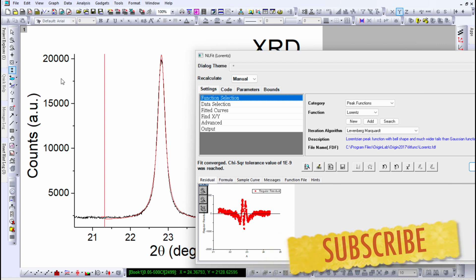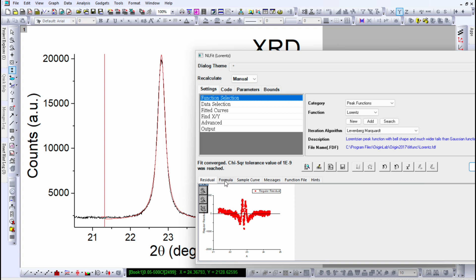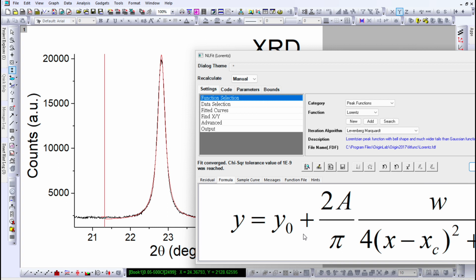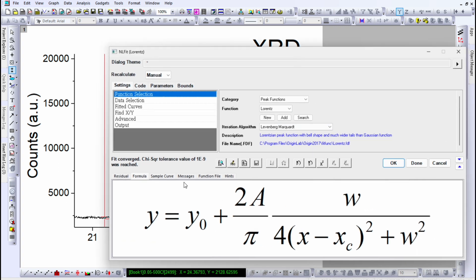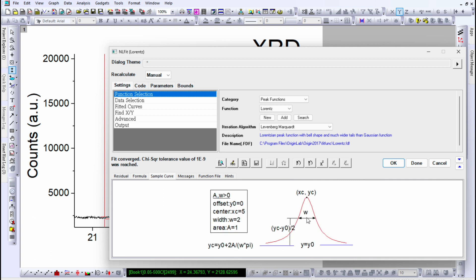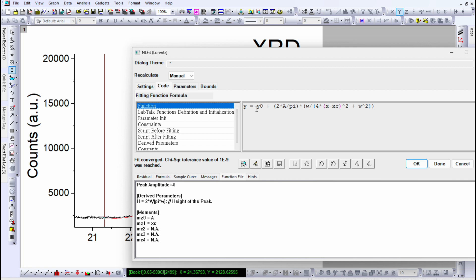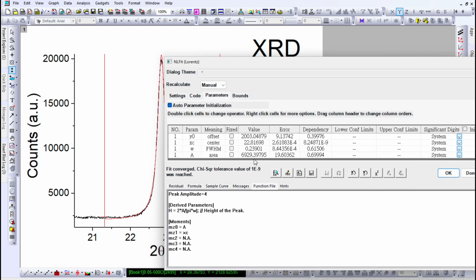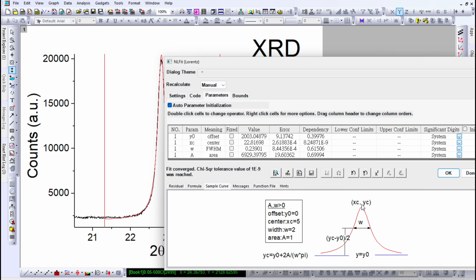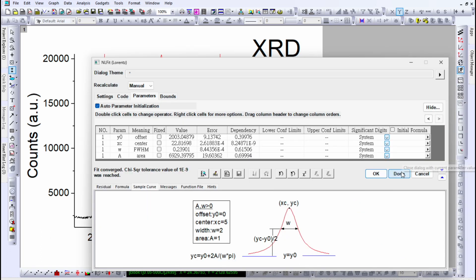The residual is very low compared to the intensity — the intensity here is about 20,000 while the residual is around 1,000. You can view the formula for the Lorentzian function, and also the sample curve which shows the full width at half maximum (FWHM), where w is the width parameter. You can also view the code showing the formula used to fit this curve. The parameters are y0, xc, w, and A. Here w is the full width at half maximum, which is 0.239 for this sample, and xc is the peak center.